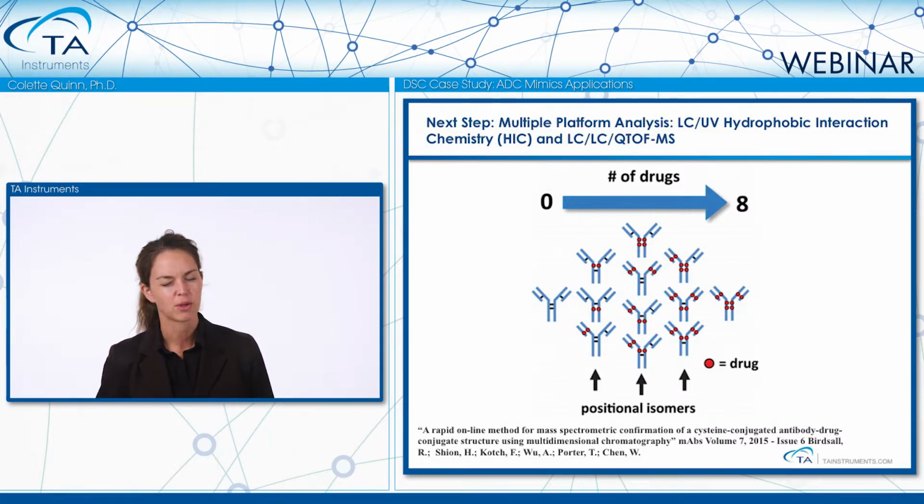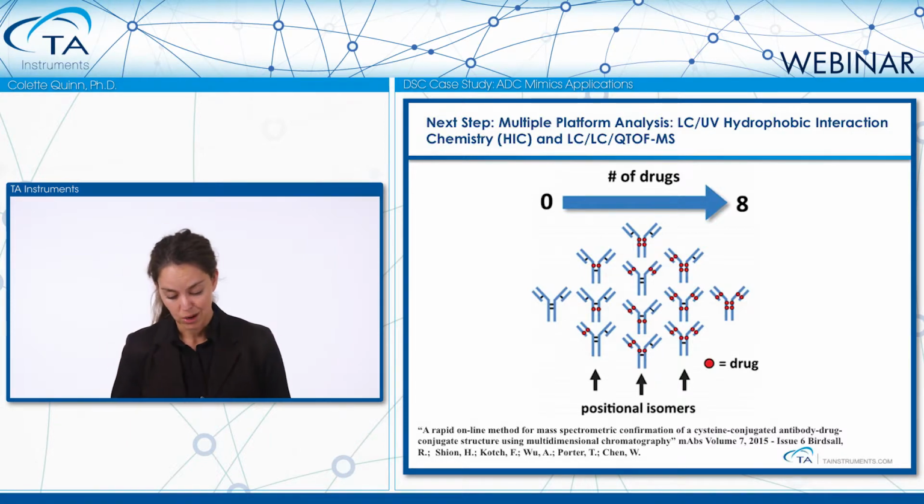So if we think back to both of those conjugates that we had on the DSC, definitely the CH2 domain is where we saw the large degree of stability change. So very nice complementarity between this particular assay and the DSC assay. The DSC gives you a nice place to look at the CH2 domain. That's definitely where some changes are, and that could be followed up, or in addition to this very nice separation chemistry assay. And then I guess the other question is, where else do we go from here?